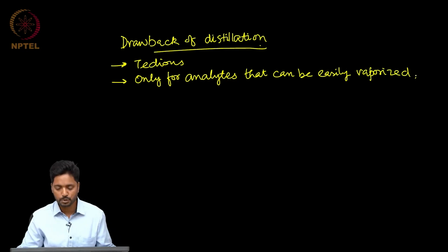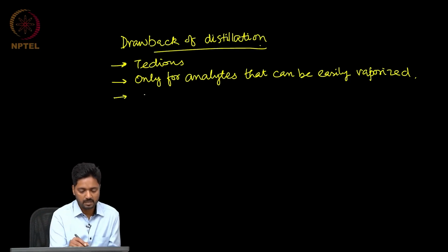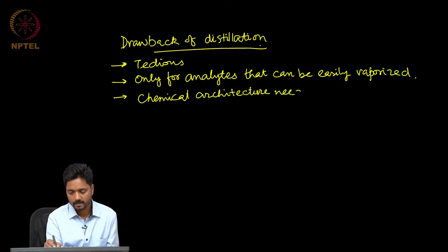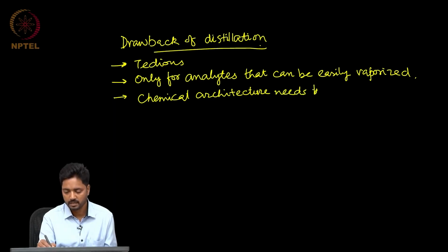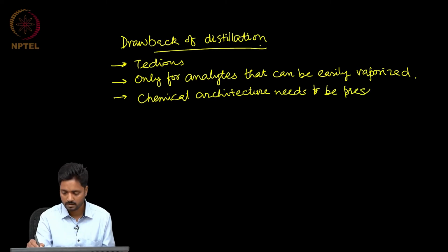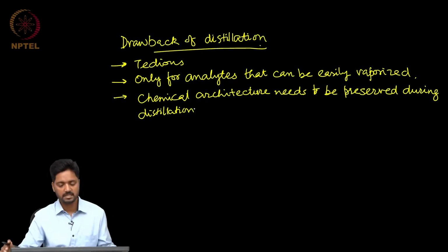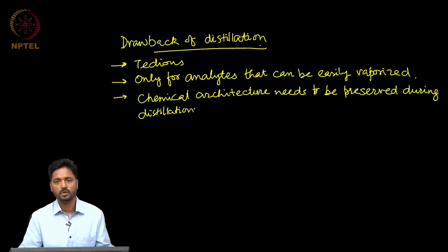Now, it is of course true that not very many organic compounds can be easily vaporized while ensuring the chemical architecture is preserved during distillation, and that started becoming a challenging process for a large number of solutes.